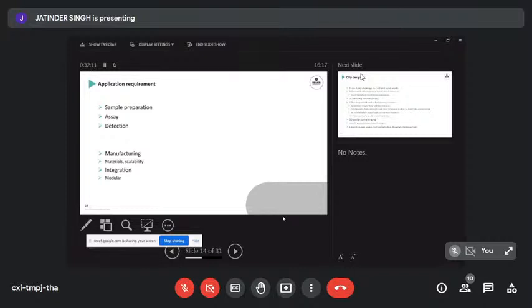It's fine for 10, 20 devices on the lab bench. If you really want to come up with a commercial winner where you want to sell 100,000, good luck finding someone that wants to cast 1,000 chips, put them in the oven, cut them to size, peel them. So it's not a scalable manufacturing approach. And the closer you get to commercial value, the more important scalable manufacturing becomes, because if you want to sell your product, it needs to be made somehow.